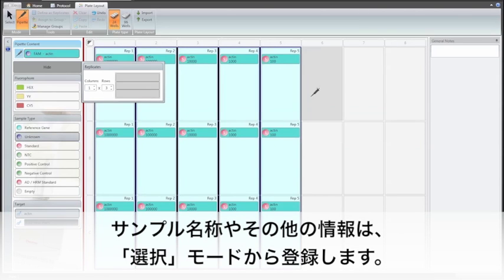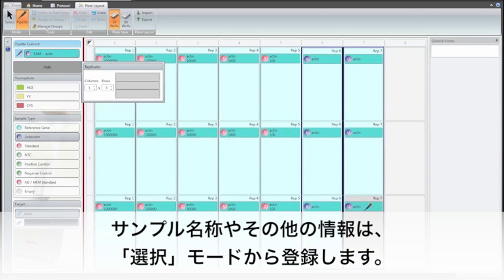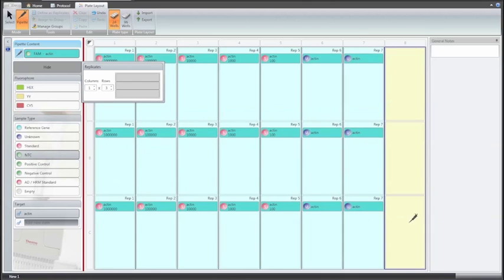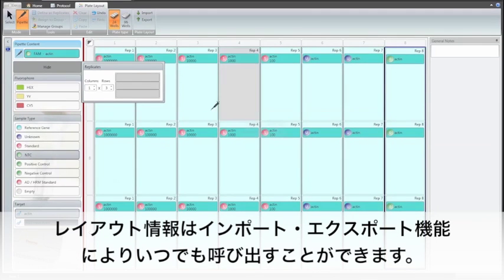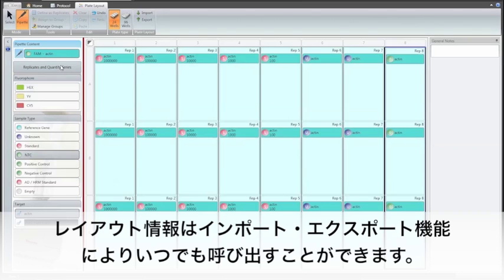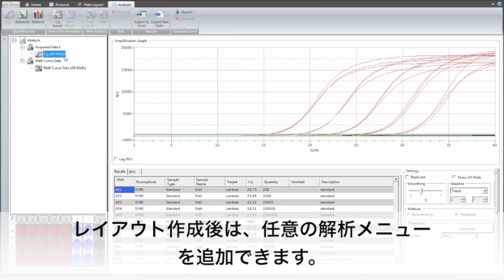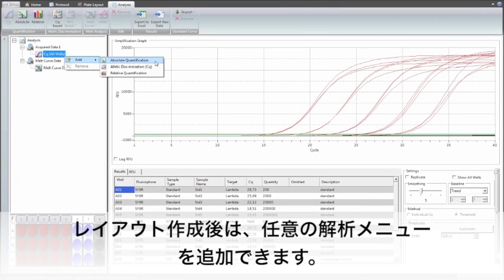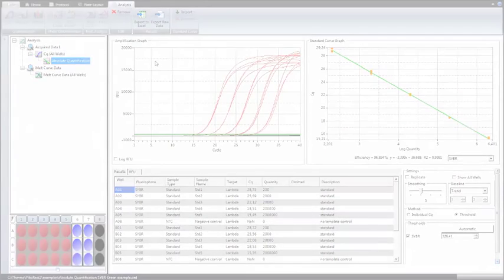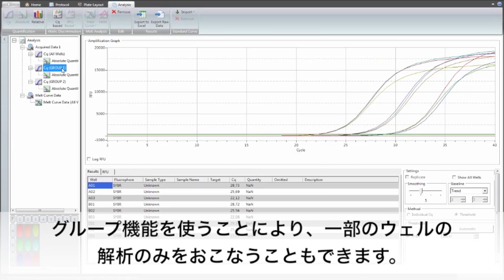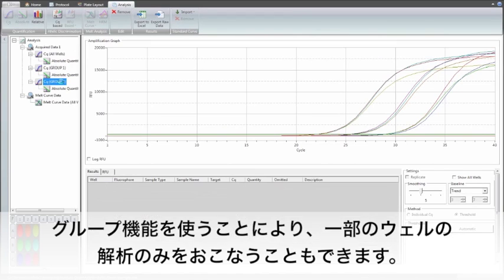Sample naming and other properties are added using the selector mode. The created layouts can be readily utilized later by using the software's import and export functions. After the layout is created, the desired analysis modes are added to the analysis tree structure.